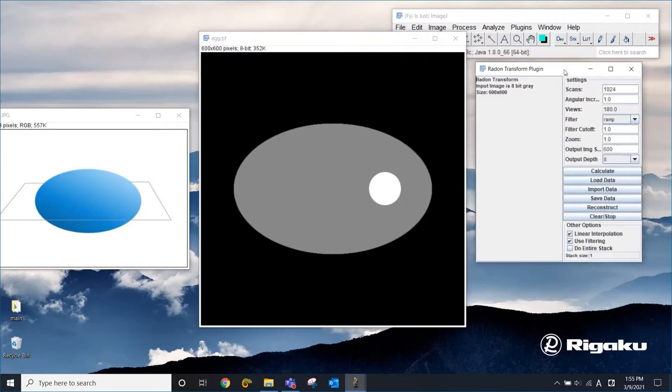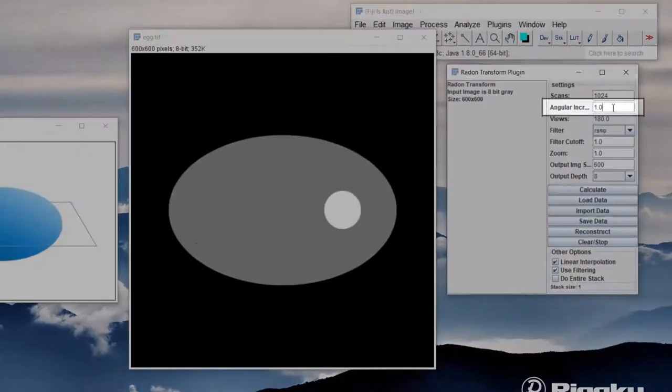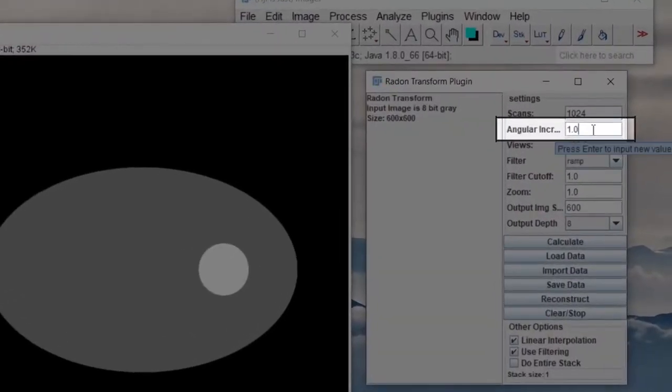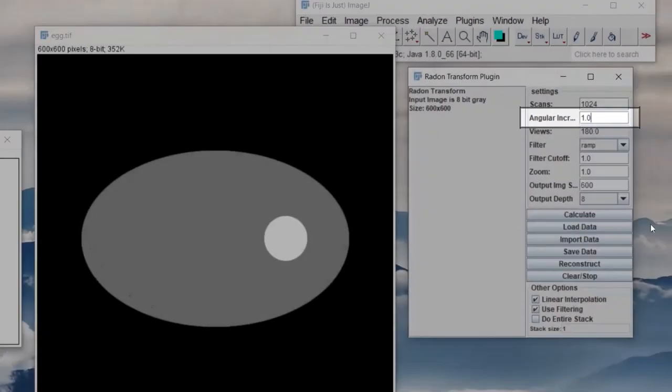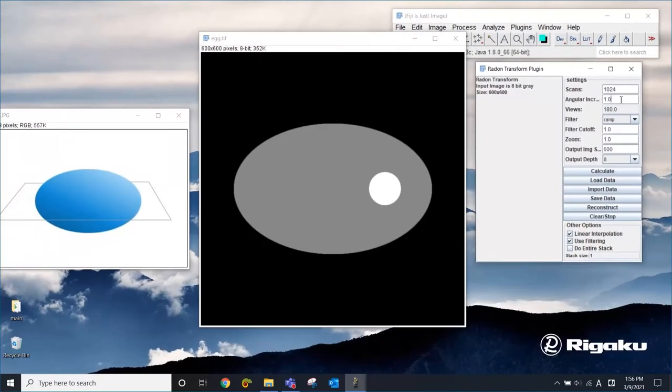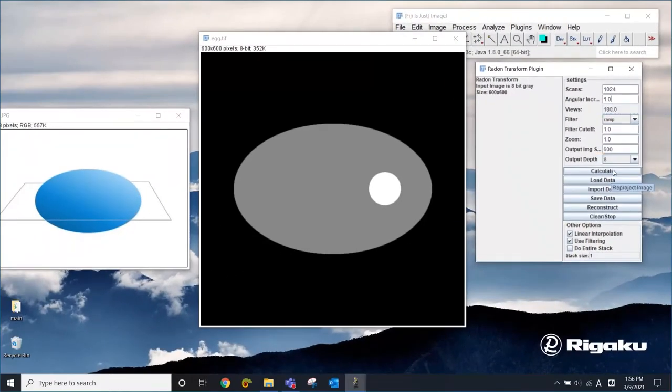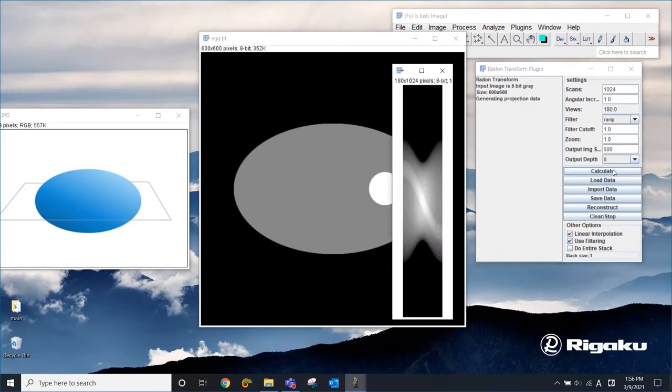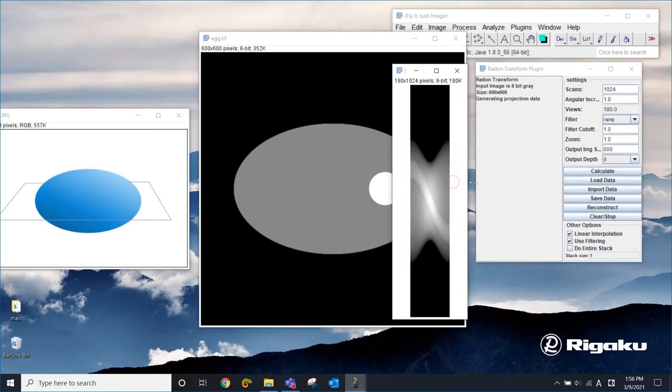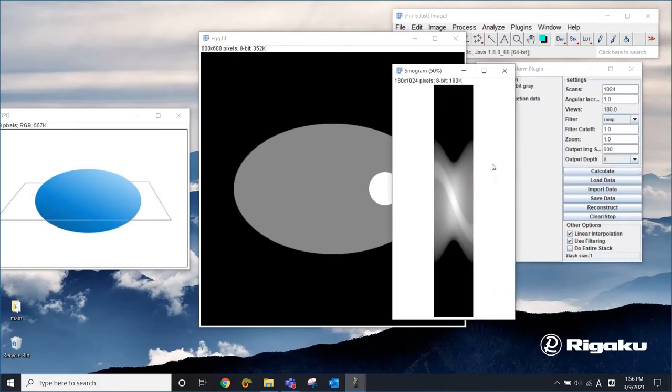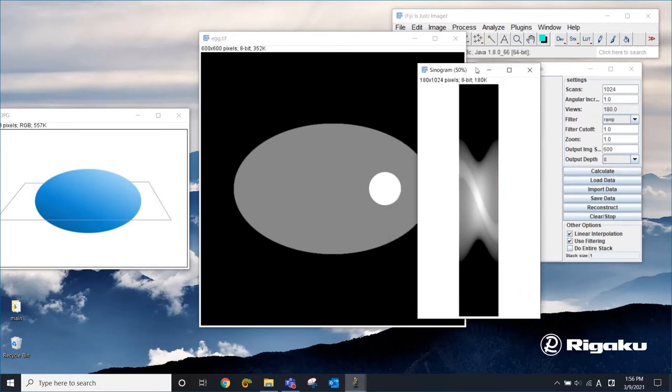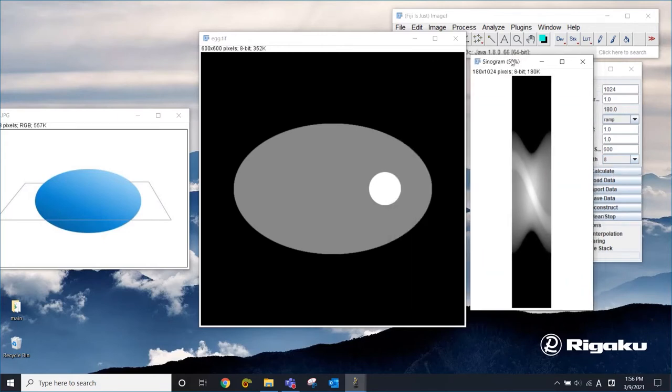There are many parameters, but we're going to just look at this one, the angular increment. I'm going to leave this as one for now and click calculate, and it's going to calculate a set of projections from zero to 180 degrees. So we have 180 projections here. This is what sometimes people call a sinogram.